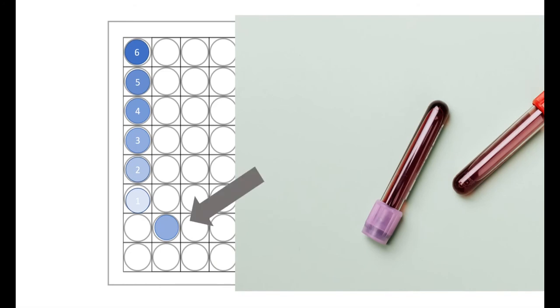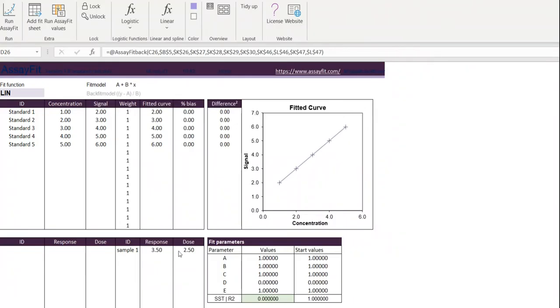standard. In this example, the measurement has a similar color to a standard with value of 3, so the concentration in this sample will be around 3. To also obtain accurate intermediate values between the calibrators, the color measurements are fitted to a mathematical function in a process called curve fitting. In this example, 5 standards are shown, with known concentration values of 1 to 5.